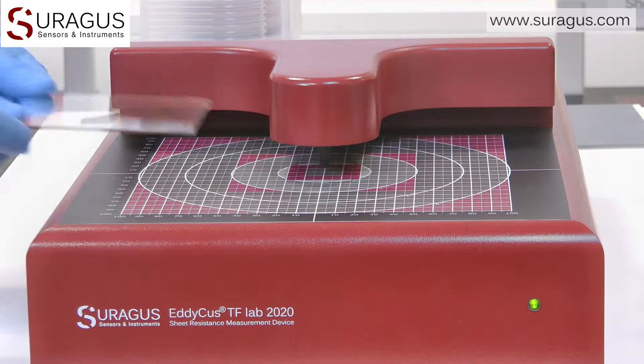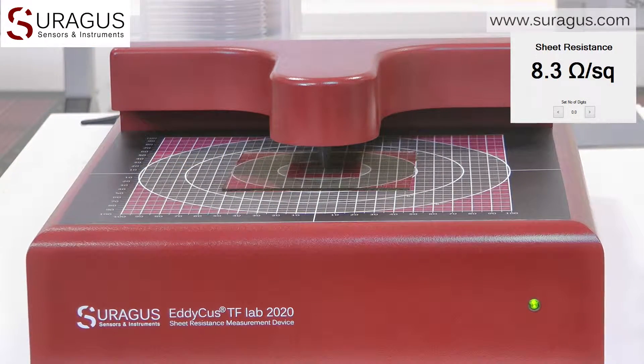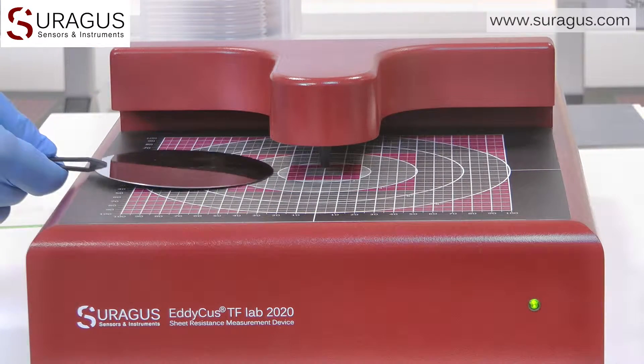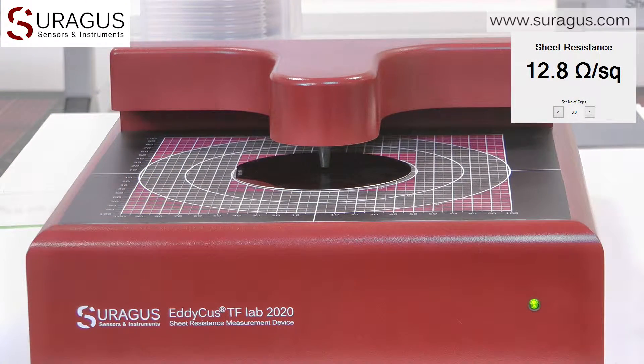Or let us measure the single, double, triple low-E layers on architectural glass. Or any kind of wafers, wafer dopings or wafer coatings for semiconductor and photovoltaic industry.